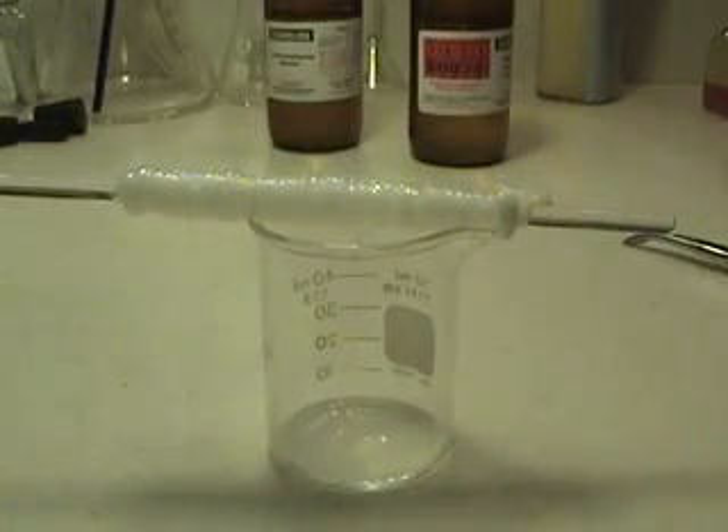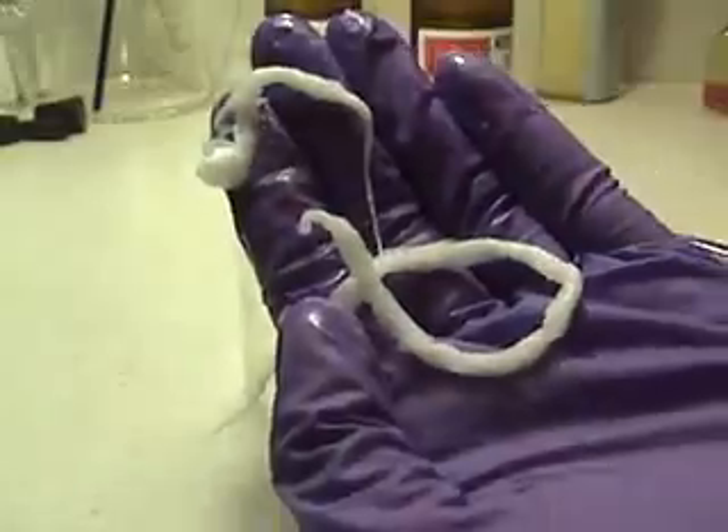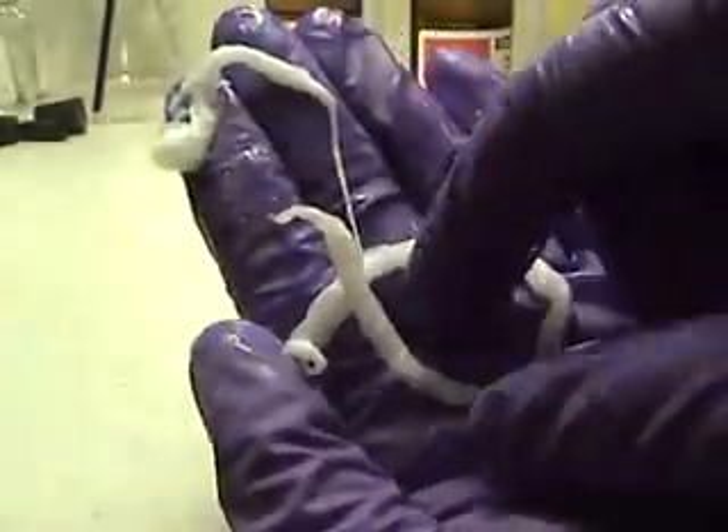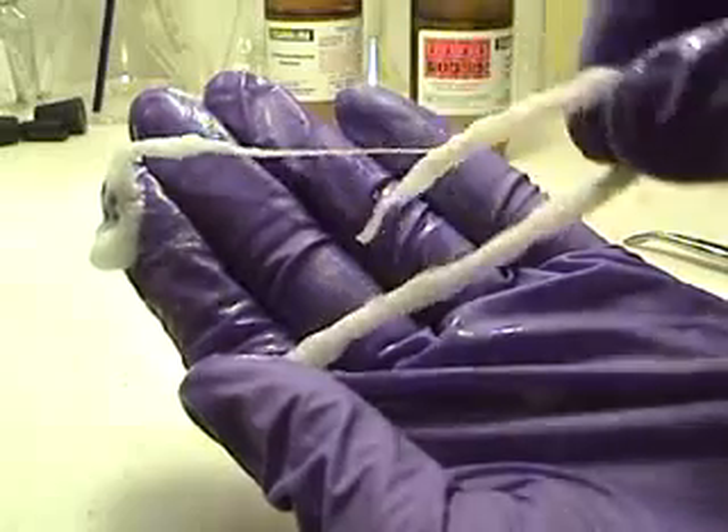Depending on how long you want this for, you can sometimes wash it and dry it out and keep the strand. But if you just leave it on the rod, then it will stick together and you won't be able to do anything with it. As you can see I wasn't able to wash it sufficiently, and I just pulled it off the rod and it is just a clump of nylon.